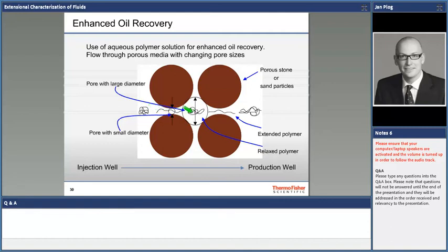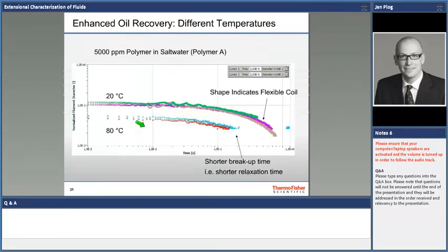And now when the polymer has not enough time between two pulses to relax, it will eventually break. And when that happens, the material's behavior is not what you expect, is not what you need anymore. Okay, and that is why you need to look into the extensional properties. And the flow field that is prominent there is the exact same thing that you do with a CaBER.